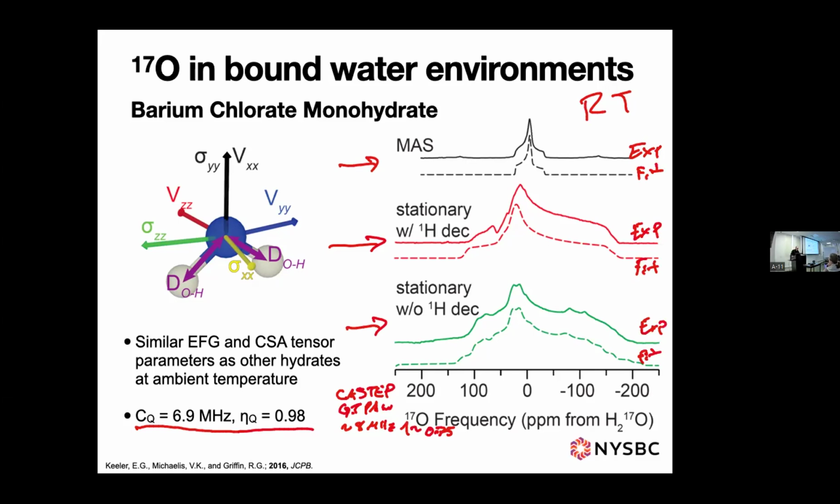I can't remember which one I used for these particular ones. The assumption is these are all central transitions. So you get considerable narrowing with MAS, but it's still 20 ppm broad or something. So there's a lot of central... I don't hope to resolve two waters in the same sample in this way. We'll get there later, but not in this. We're building here on this.